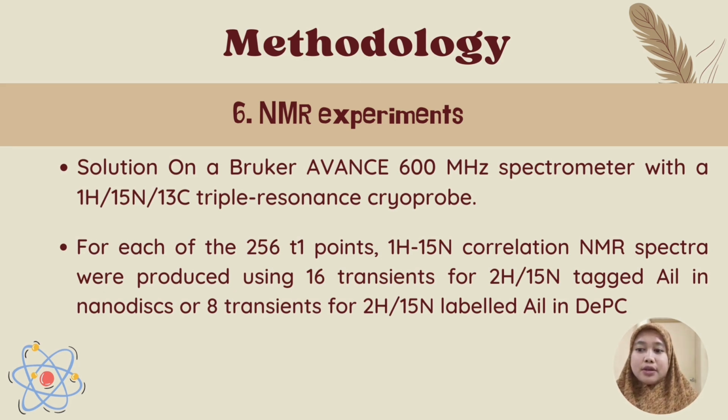The magnetization transfer time used to obtain the 15N spectra was 2.5 ms, with a transmission time of 1.67 ms and a refocusing delay of 1.11 ms.